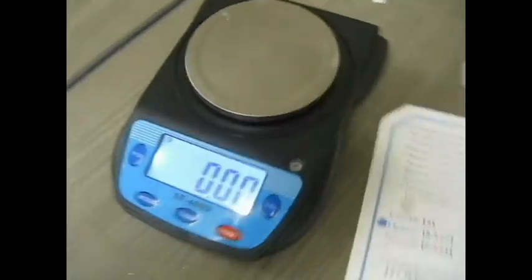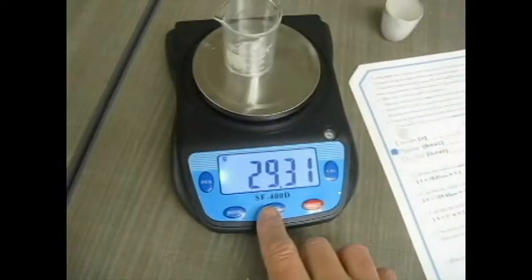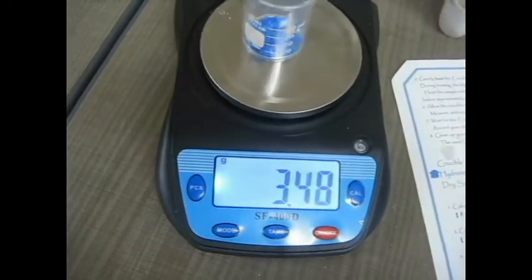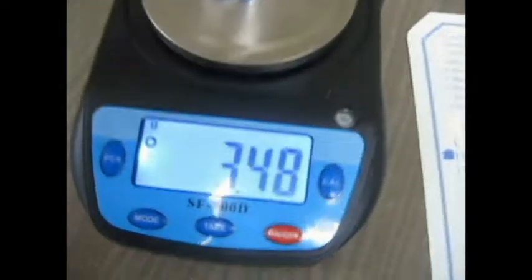Now I want to use a beaker. I'm going to tare that, ignore the glass, measure out about 3 grams. You know what? I'm not going to worry about getting it exactly 3. Instructions say 3. There we go, 3.48, whatever, close enough. So write that down for the hydrate. This is a hydrate because that's why it's blue. Copper sulfate is not actually blue unless it has water. So that's the mass of the hydrate.